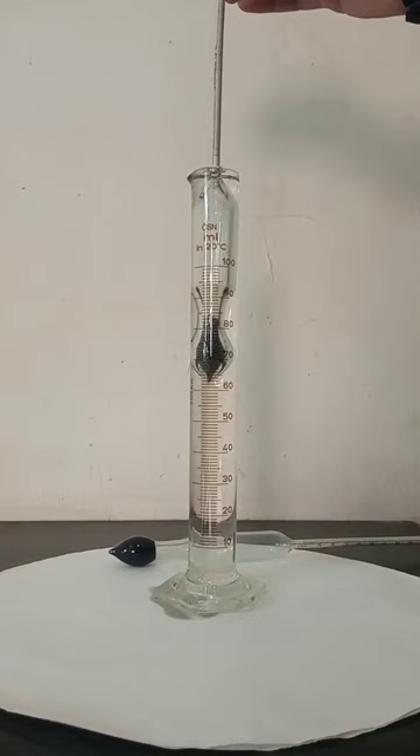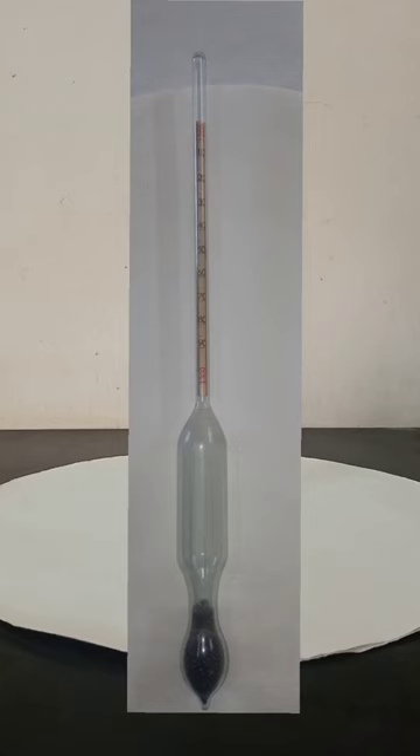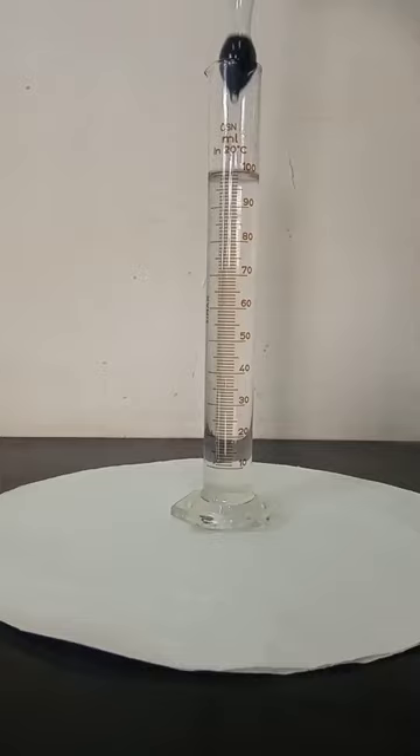The ballast causes the instrument to float upright in a liquid like a fishing bobber. A second glass or plastic cylinder, commonly known as a hydrometer jar, is filled with the liquid being measured. The hydrometer is then placed in the hydrometer jar containing the sample liquid. The specific gravity of the sample liquid is indicated when the level of the sample liquid in the jar aligns with a point on the hydrometer scale.